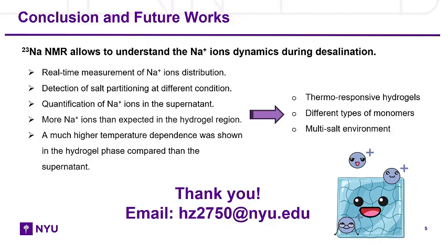The final slide is a short summary of my current results. For the future plan, I will also apply this analysis on the thermoresponsive polyelectrolyte hydrogels. Our final goal is to use NMR to develop an efficient way to determine hydrogel desalination performance and hopefully use this method to provide supportive information for future research on thermoresponsive polyelectrolyte hydrogels.